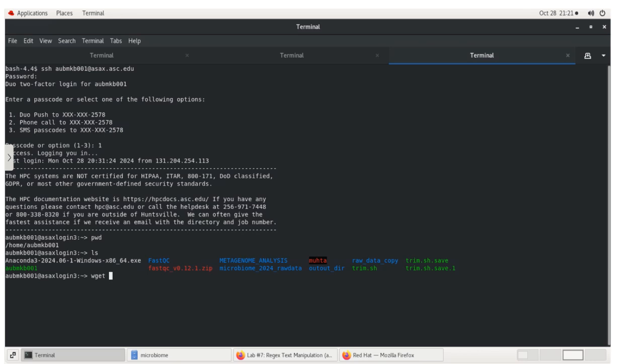If you are already in the directory, if you need to make the directory, you can make the directory by using mkdir and the name of the directory. Then you can download all your data in that particular directory. As I already have all this data in those directory, I am just gonna change my directory to that data. So now I am in the directory where all my raw data are in now.